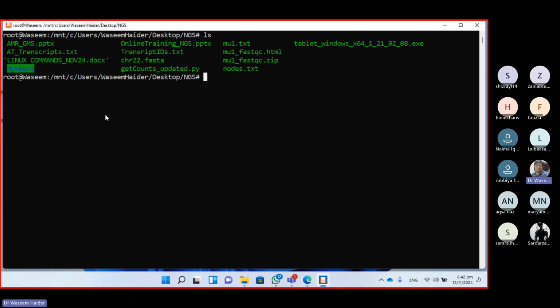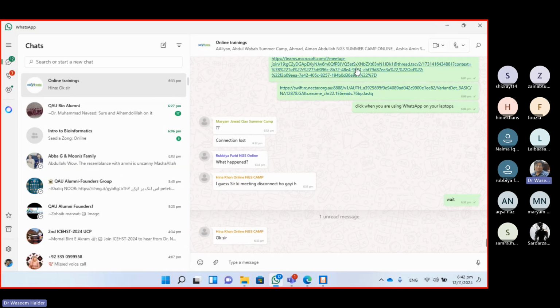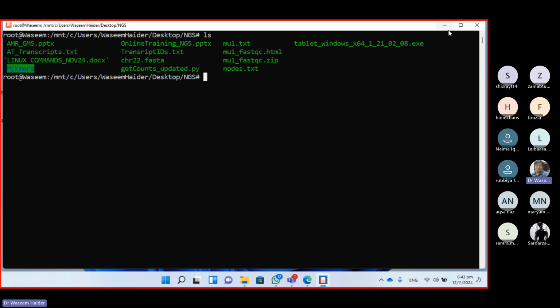You can also do genome assembly. For the people who are asking for practice, just take that data set which we highlighted, download it and put it on your laptop, then do QC and assembly, see what sort of contigs you are getting, and tell me from which source this read data is coming. That's our assignment. Also discuss the QC reports.